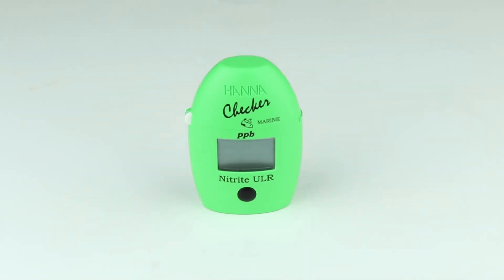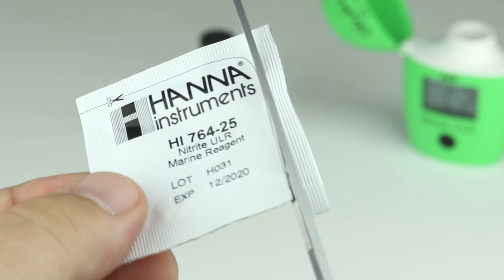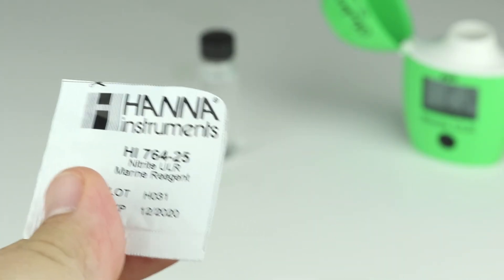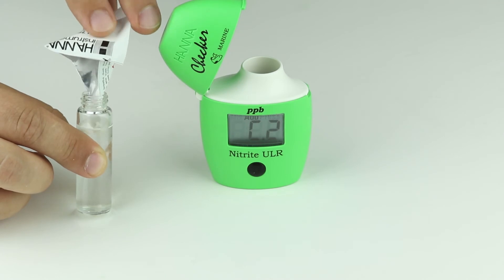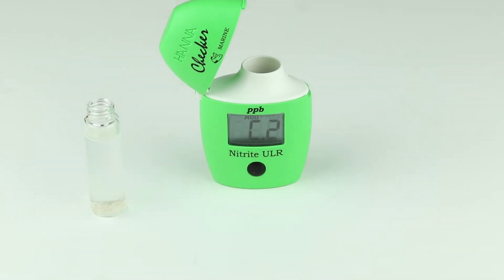Press the button. Once the screen shows ADD-C2, remove the cuvette from the meter and add one packet of HI-764-25 reagent, then place it back into the meter.